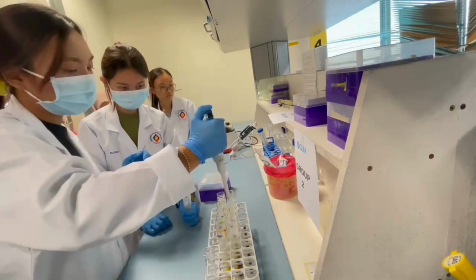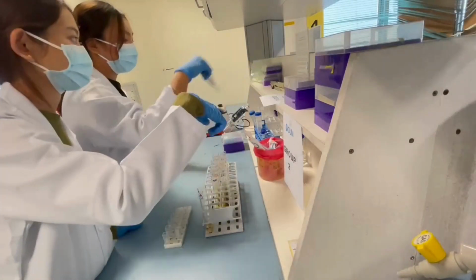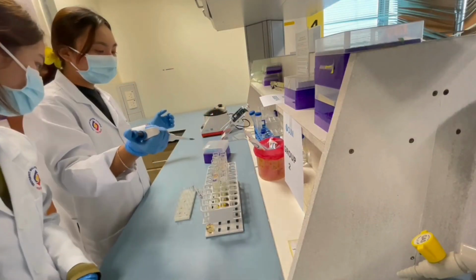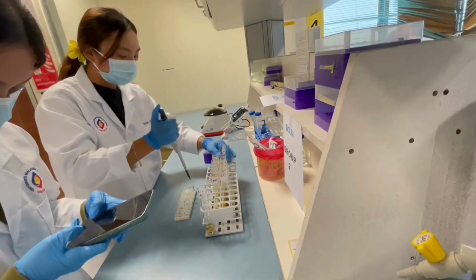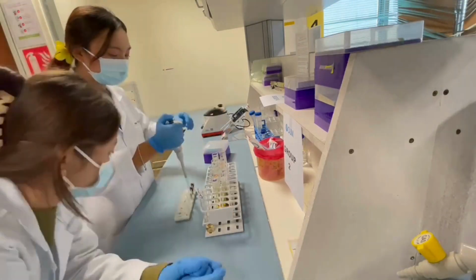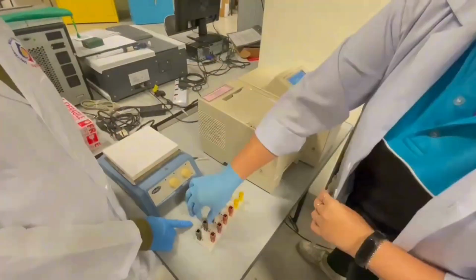Then, add 1 ml of Rochelle salt solution into the mixtures. Then, transfer the solution into the cuvette. And finally, the last step is to record the readings.